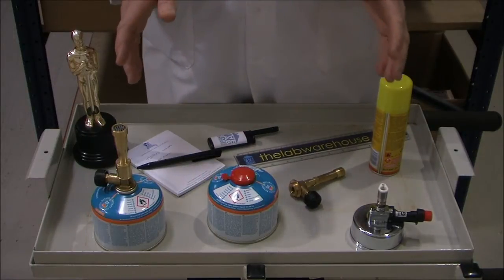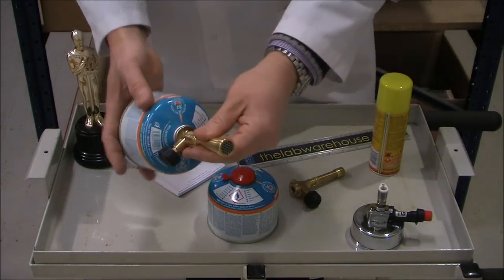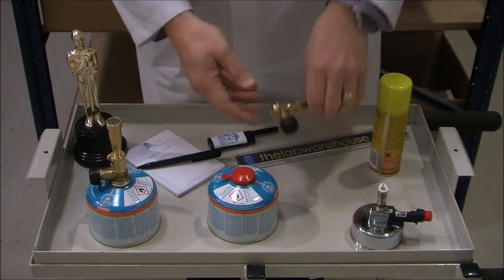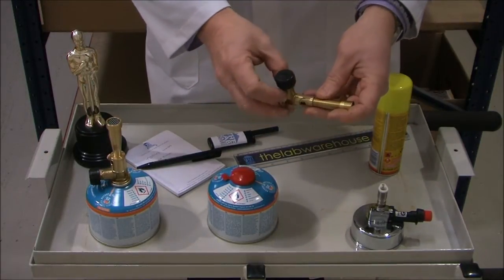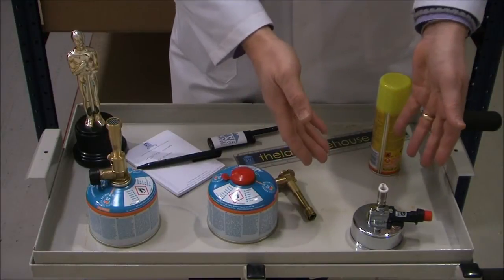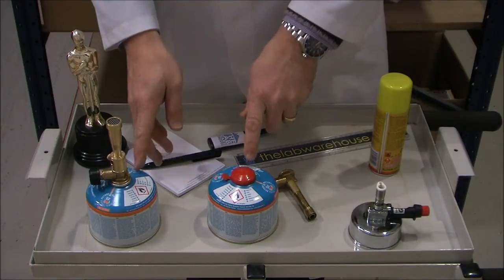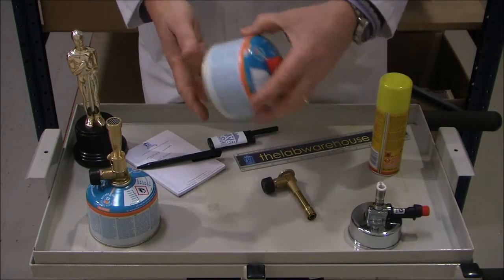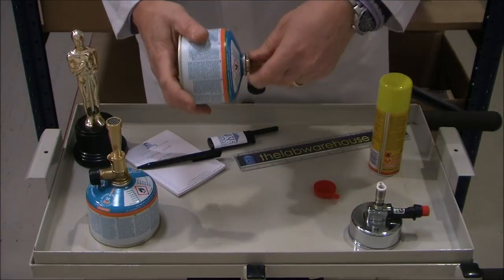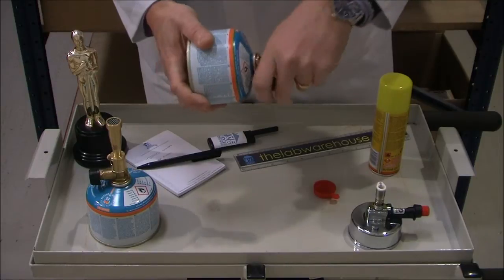The Lab Warehouse range of portable Bunsen burners consists of a Mika burner, a standard Bunsen burner with adjustable collar, and this rather neat micro burner, which features Piso self-ignition. Now these two accept a standard gas cartridge.